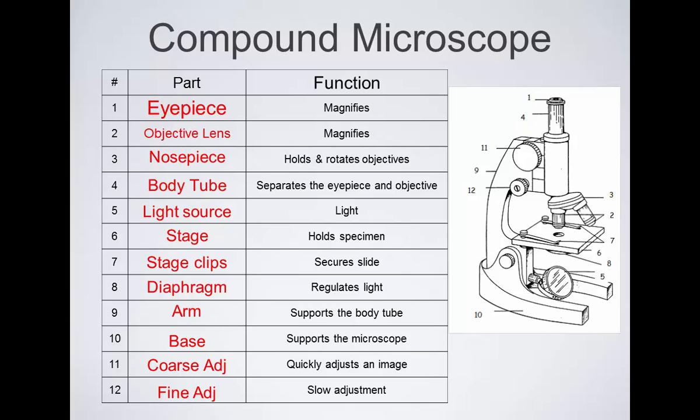The problem is that they don't work very well. They're made of plastic, and you could get some of an image, but oftentimes the lenses are made of plastic, they break very easily, and they don't give you a very good image, but you can sometimes see things through these microscopes. So this one says it goes up to 900x, almost double what our microscopes do. Probably not clear. Yeah, it's not clear at all. It has very poor resolving power.